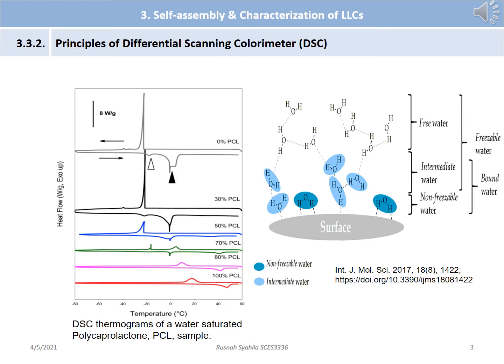When the system is sufficiently diluted, free water is present in it, which is assumed to have similar physico-chemical properties to pure water. Its presence can be detected by so-called sub-zero temperature differential scanning calorimetry by the appearance of the melting peak on the DSC thermogram at about 0 degrees Celsius. The disappearance of the melting enthalpy of water, that is, the disappearance of free water, coincides with phase changes occurring in the liquid crystalline structure. The knowledge of the proportion of varying types of water is important to get information on the structure, which has a strong effect on drug release from pharmaceutical formulations.